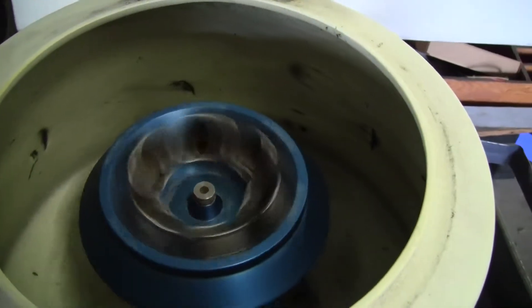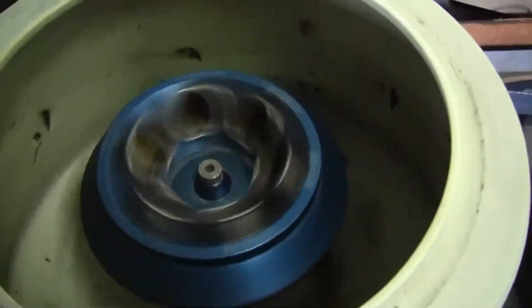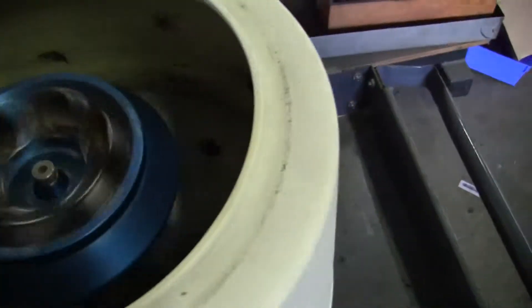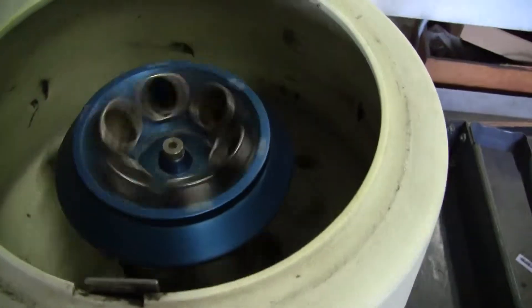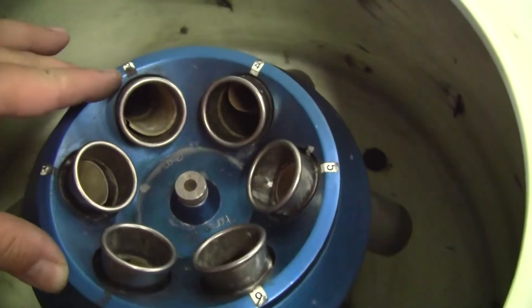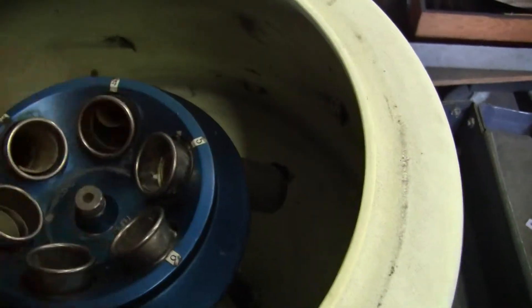Let it spin down. Two rotors. It's a six-place rotor.